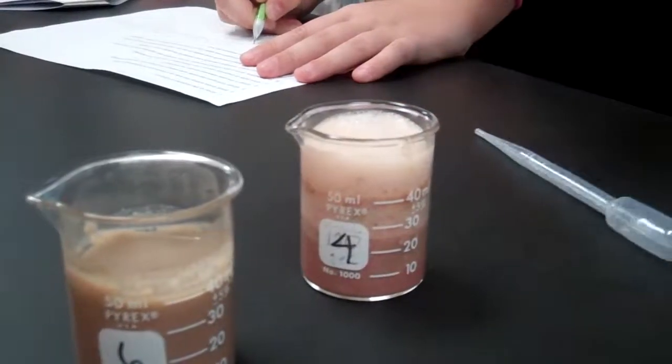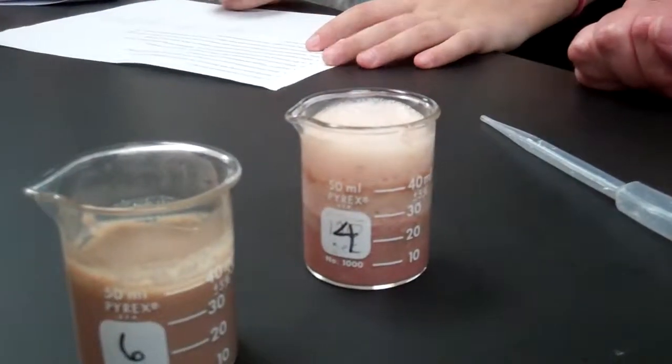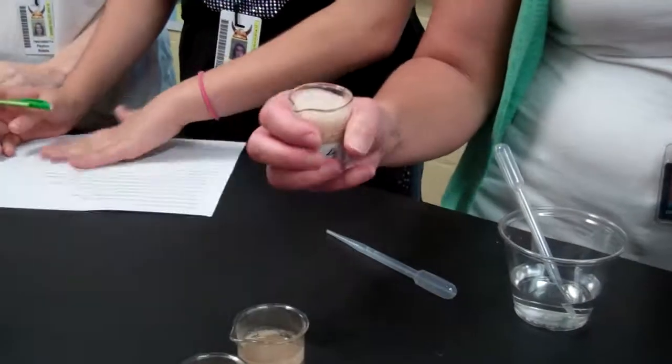Alright, well, if I poured more on, what would happen? It would overflow. And why? Because it would be more chemical reaction. What's still in the liver? Enzymes. Do enzymes get destroyed by a reaction? No, they can be used over and over again.